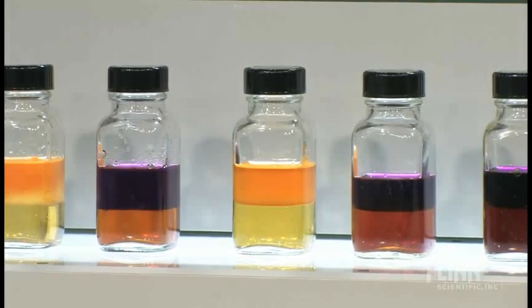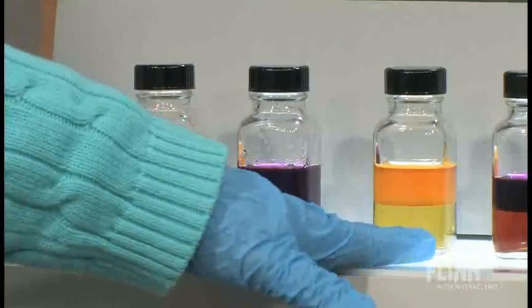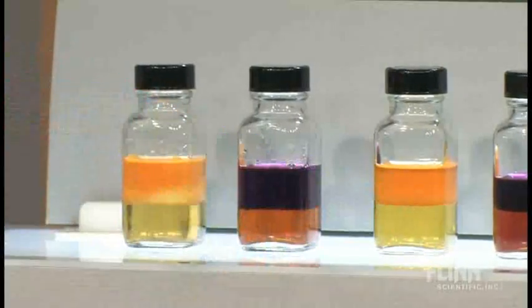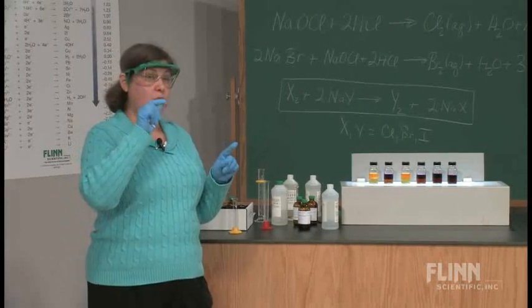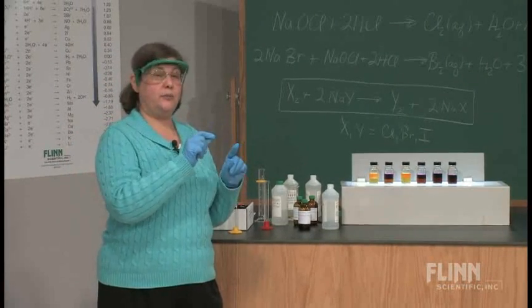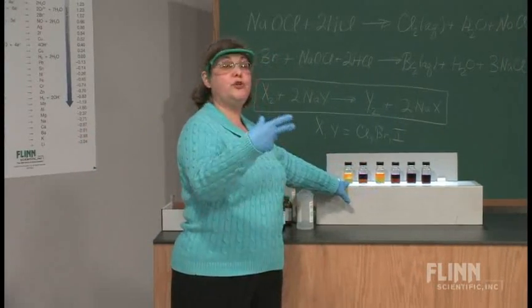Similarly, this was chlorine with sodium bromide. We produced bromine, and that looks just about identical to bottle 3, which had bromine with sodium chloride. So that means the bromine did not react with sodium chloride, and it's just the original bromine, but here we produced bromine.